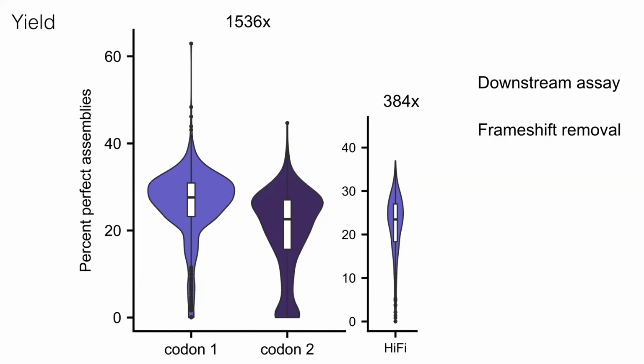I would suggest you look at that particular option if your protein has very few methionines downstream, because what we've seen is that the ribosome can actually restart translation back in the correct reading frame after the frame shift has occurred, basically killing your enrichment. So while you do get an enrichment, any downstream ATGs can be a pretty large issue there.